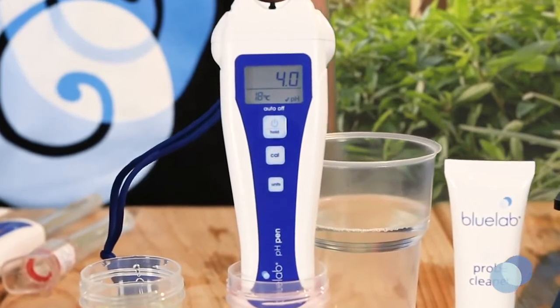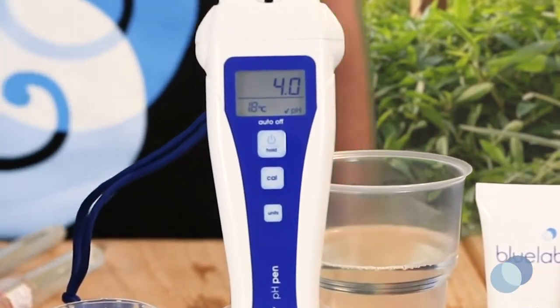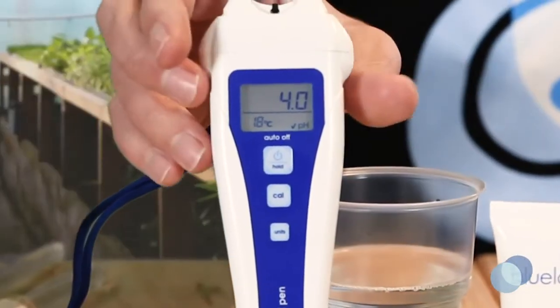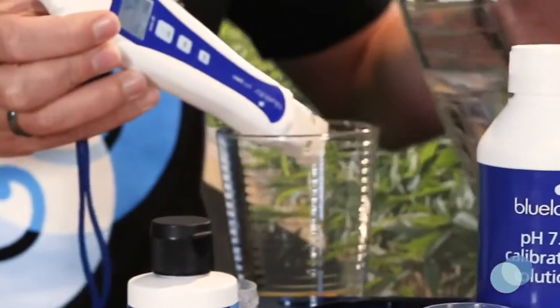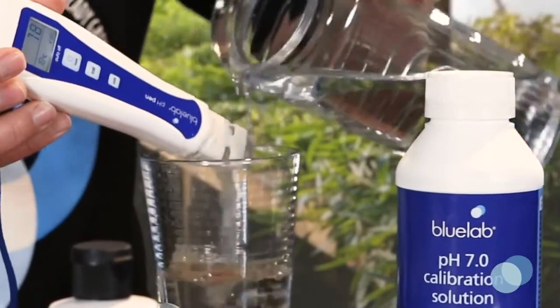A check mark will be displayed at the bottom of the screen to indicate a successful calibration. It will disappear after 30 days to indicate calibration is required again. After calibration, rinse the probe tip in fresh, clean tap water, then shake off any excess water.